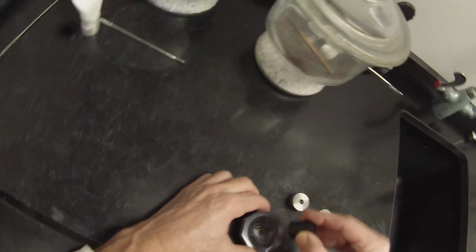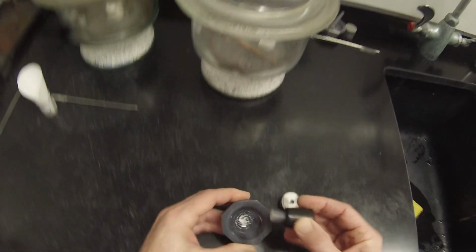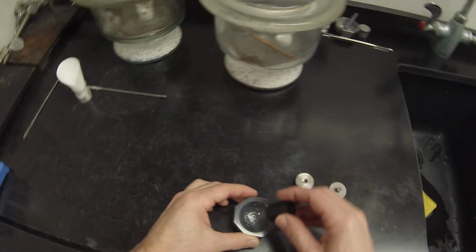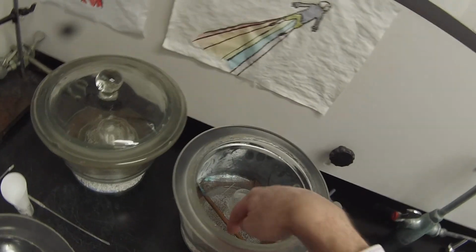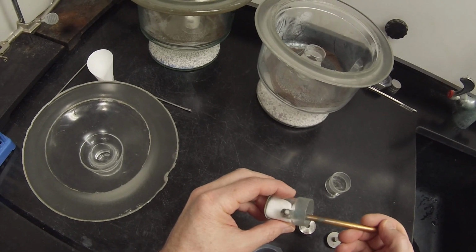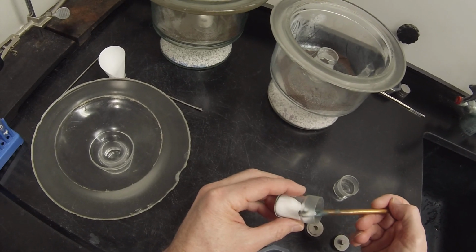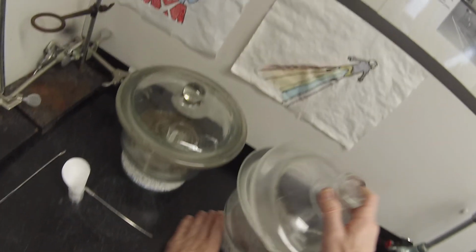So now I want to grind this up, get it to stick to the die. Alright, that looks like it's probably not going to come out, pretty good. Got some fresh KBr that was taken from the stock, so it should be fairly dry. Fill that up. Drop that in. The desiccant in this desiccator is mostly pink, so that'll need to be replaced soon.